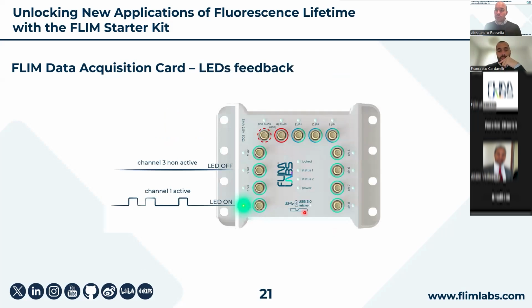Another feature that we implemented in our FLIM data acquisition card was to equip it with LEDs that blink at a rate proportional to the incoming signal. If channel 3 is not active, we would not see any light from the LEDs, while if channel 1 is active, we can spot right away that we have a signal on a certain channel without the need of opening our software.